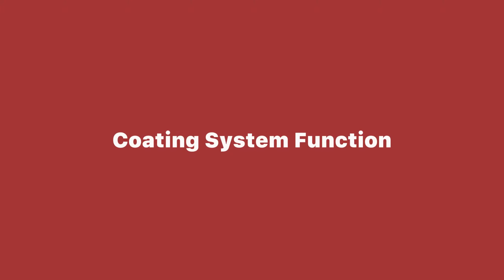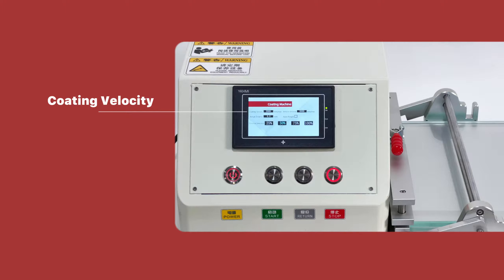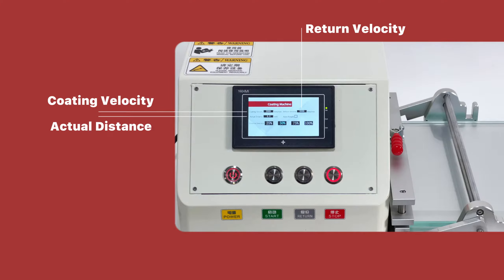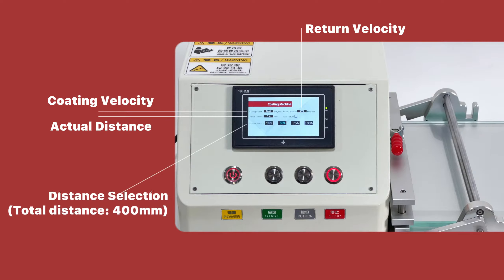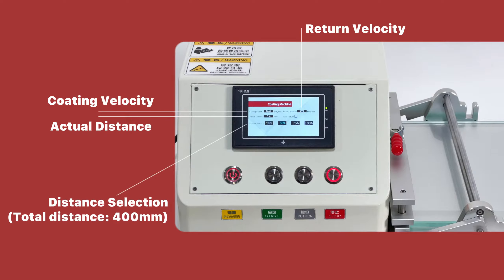The coating system interface displays key parameters: the coating velocity, return velocity, actual distance, and distance selection settings.